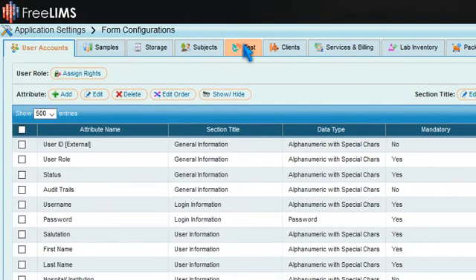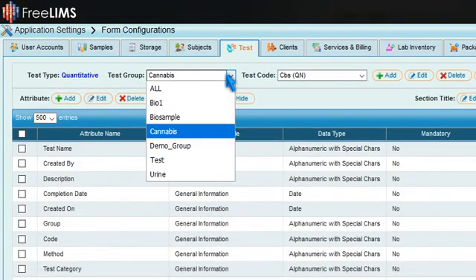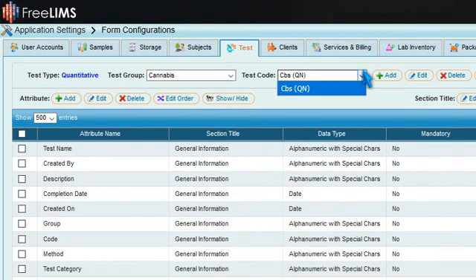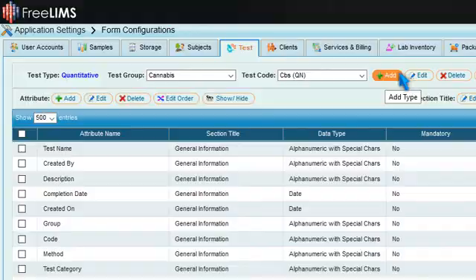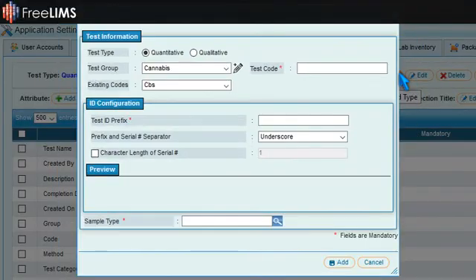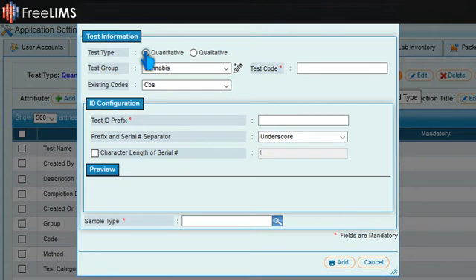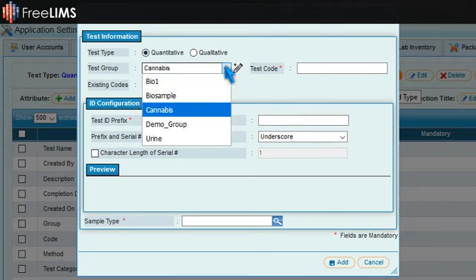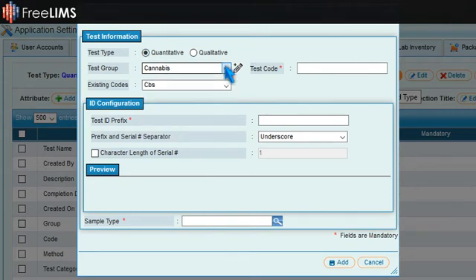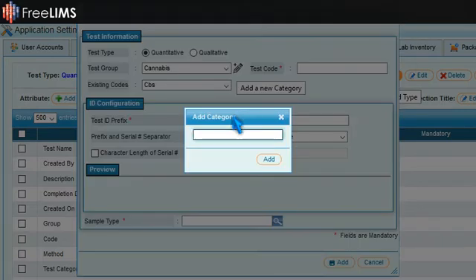Select a test group and a test code from the drop-down menu. To add a new test type, press Add and select either Quantitative or Qualitative Test Type. Select a test group from the existing groups or add a new group using the Add a New Category icon.